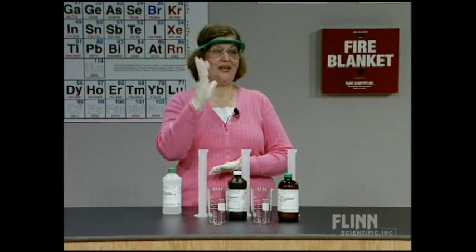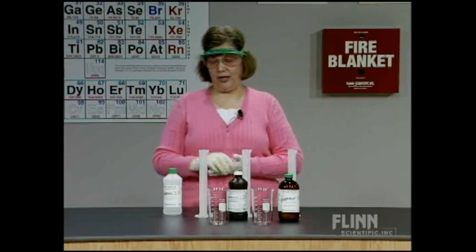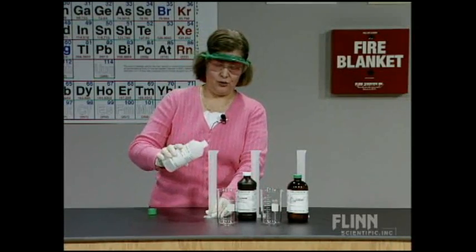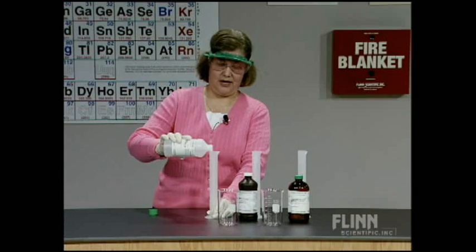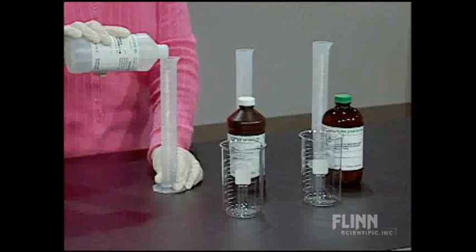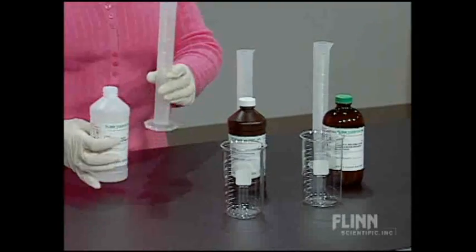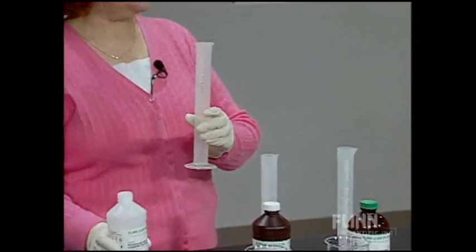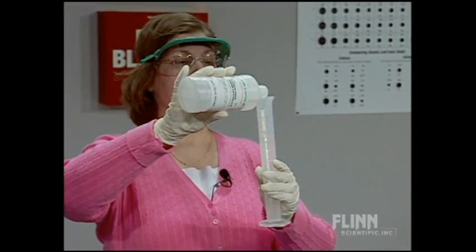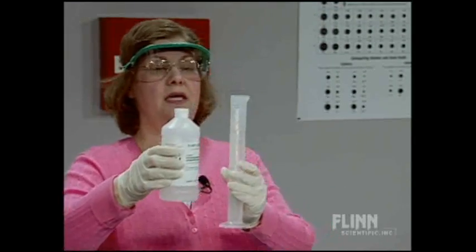So just when your students tell you that they know everything there is to know about chemical reactions, then you take this one out. And I think it will show us that chemistry still has the power to surprise. And I hope that's something that we want to teach our students a lot as well. What I have are 3 reagents, 3 solutions, and I'm going to start pouring them here. Sometimes I say the precise amount is not important. In this case, it is. And so I need about 80 milliliters of each. And I'll tell you what I've got here as soon as I get my 80 milliliters.